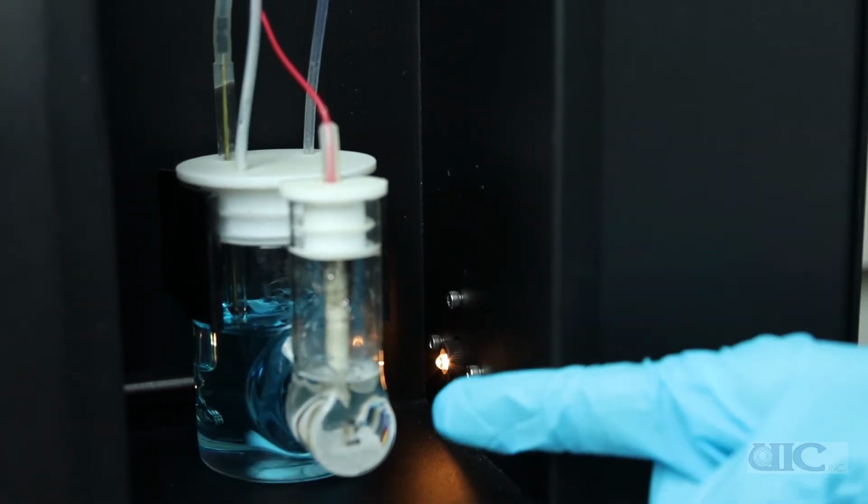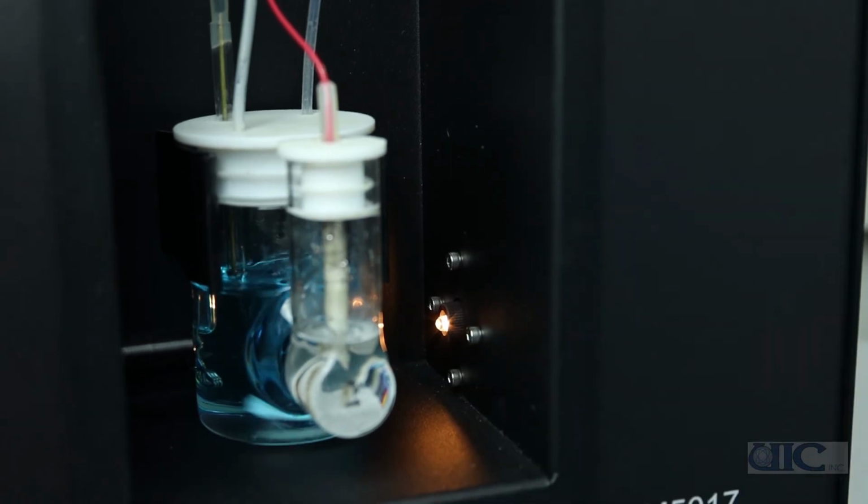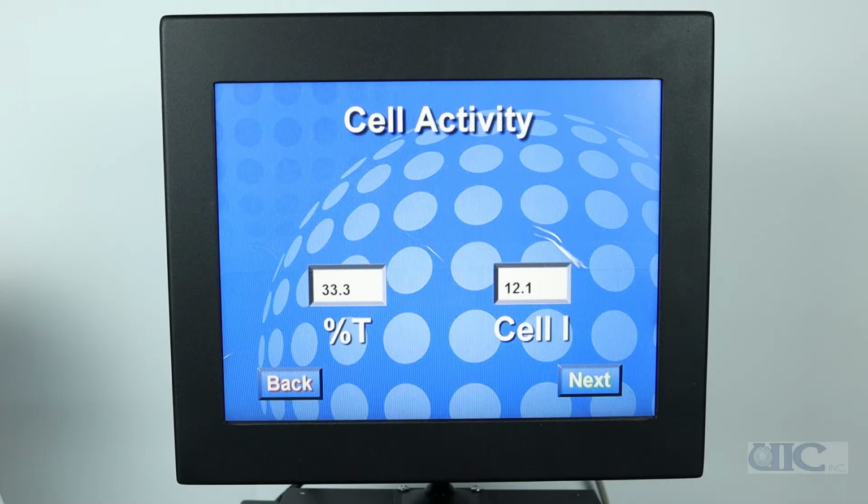The cathode solution will slowly change color and become bluer. The percent T should decrease to 29.5% plus or minus 0.1. When it does, the titration is complete. While waiting for the transparency to decrease, we recommend leaving the coulometer 45 minutes to an hour, even though 29.5 will be reached relatively quickly. This leaves enough time for the system to stabilize.